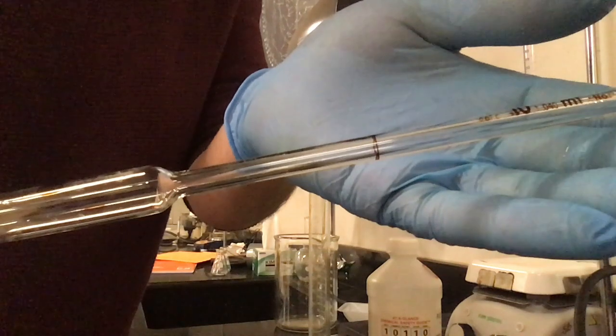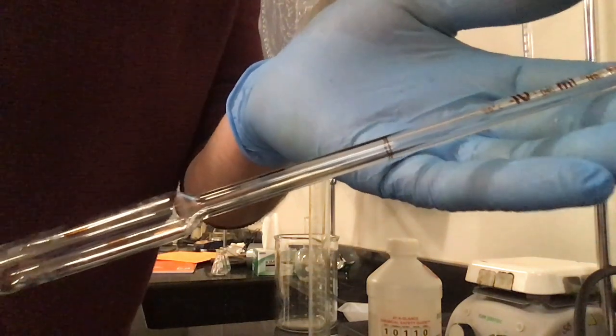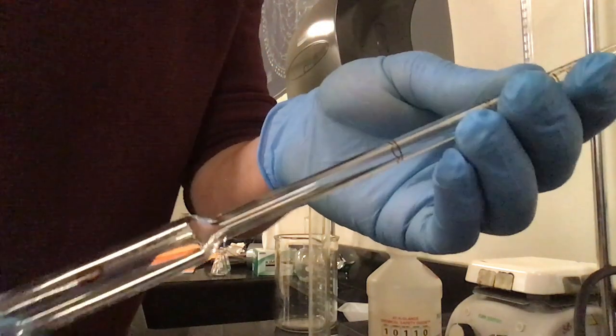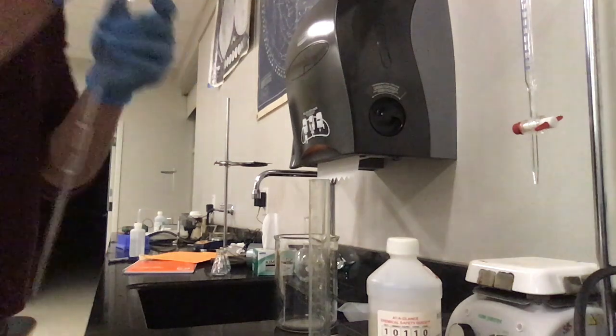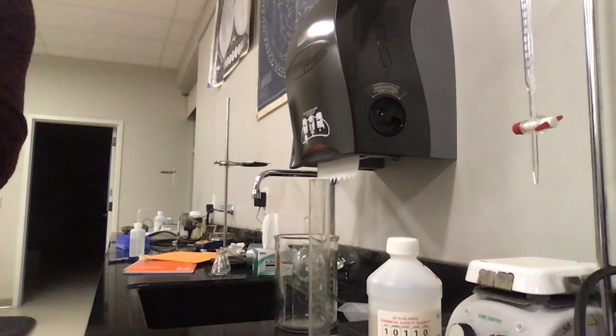And as you guys can see right there, that is my volumetric graduation, right? So I'm measuring all the way up to that line. I want to stop exactly there. This is a very, very precise amount of acid that I'll be able to get from this.